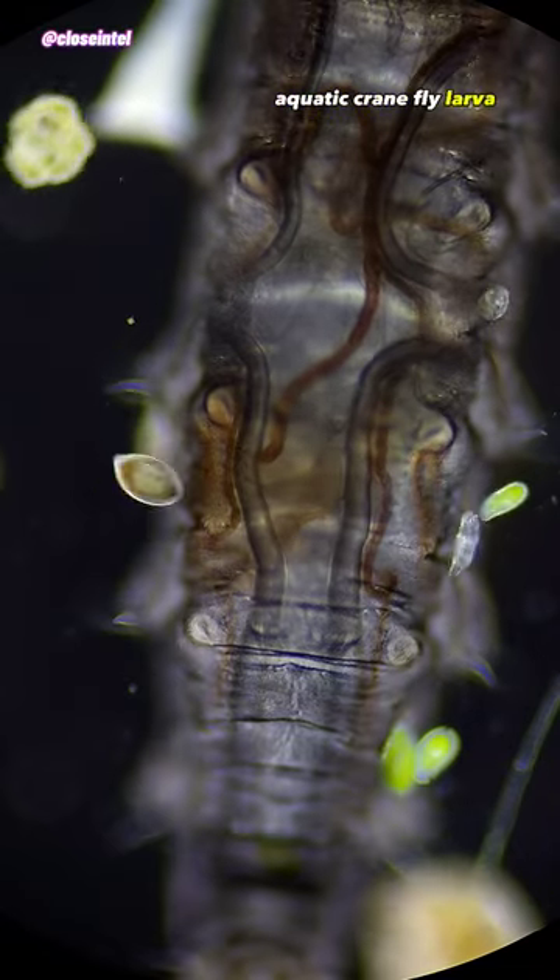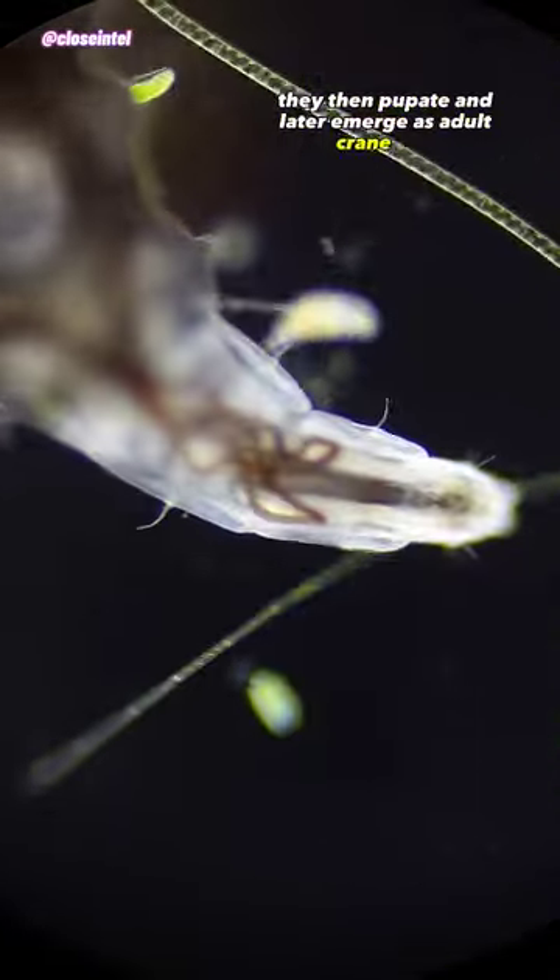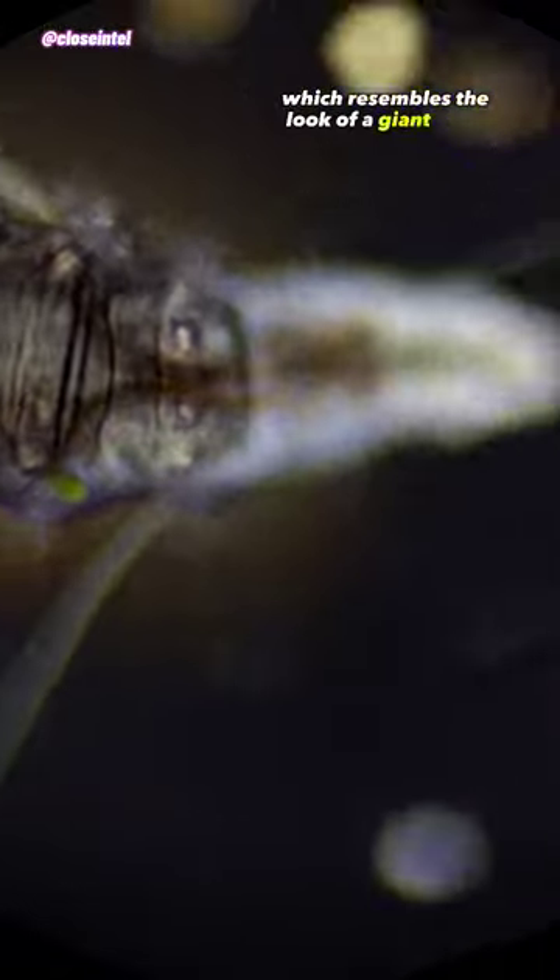Aquatic crane fly larvae feast on decaying vegetation, algae, or even small invertebrates like mosquito larvae. The larval stage of a crane fly can be as short as six weeks or as long as five years depending on the species. They then pupate and later emerge as adult crane flies, which resemble the look of a giant male mosquito.